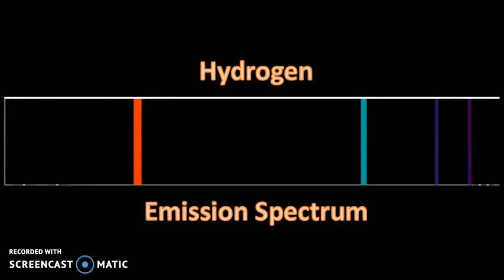Also, don't forget that this drawing that we can actually make of the light that's coming out of the hydrogen sample passed through the prism is called an emission spectrum. So this is what you should be drawing on your observation paper, the emission spectrum, starting from red and going all the way through the violet tones for hydrogen.